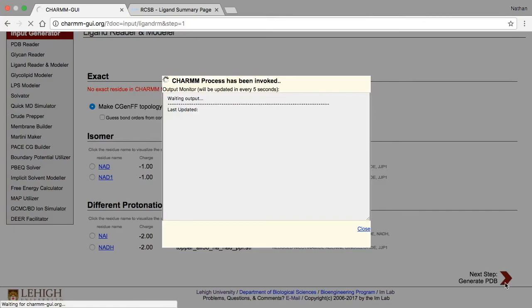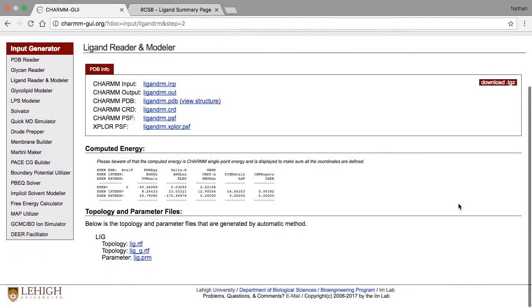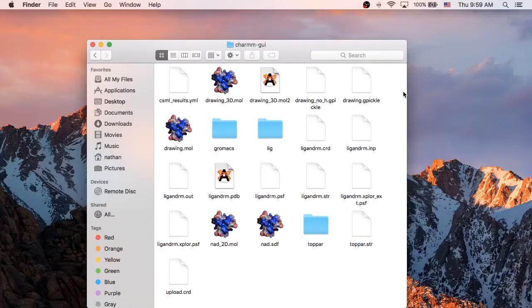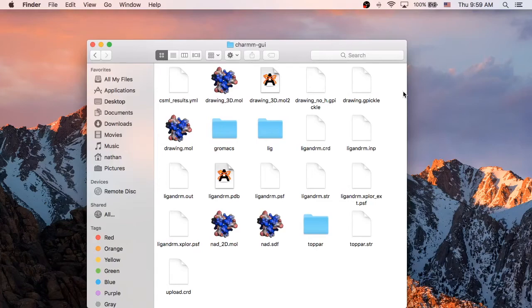When the CHARMM process finishes, download the result. This time, there are fewer files included, and this is because we loaded the ligand directly rather than loading the PDB structure.